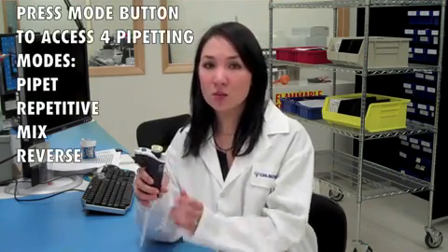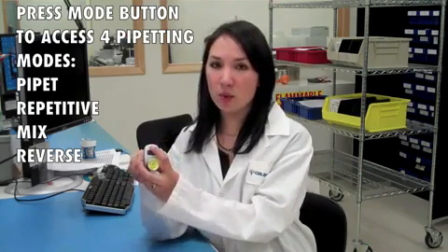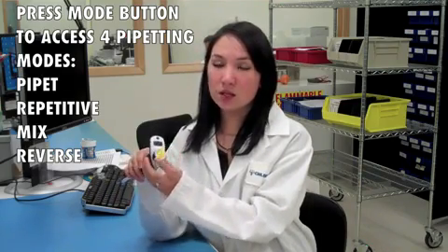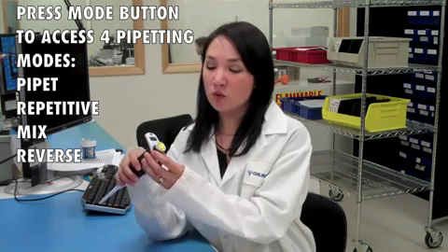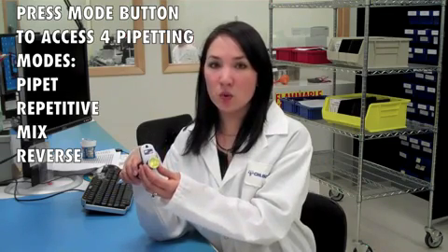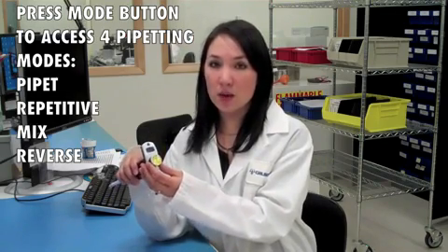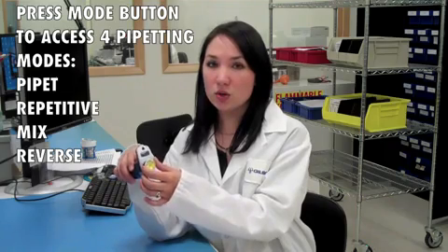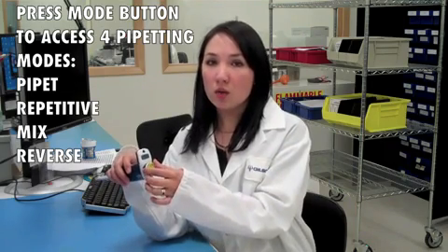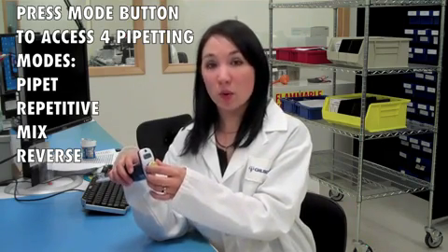The Pipetman M is also an extremely versatile pipette. It has four different pipetting modes, so you're essentially getting four pipettes in one. To access the modes, you simply click the mode button, and it takes you to a menu. It will first display the mode that you are on, which is the pipette mode, and then as you turn the volume button, it will cycle through the different modes.